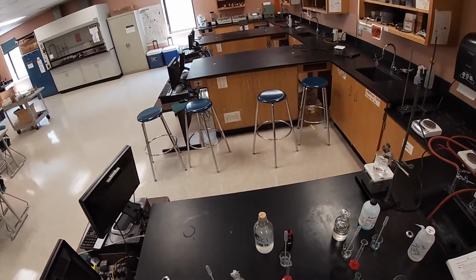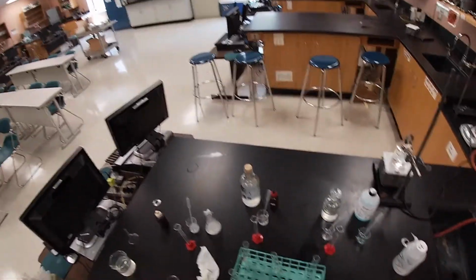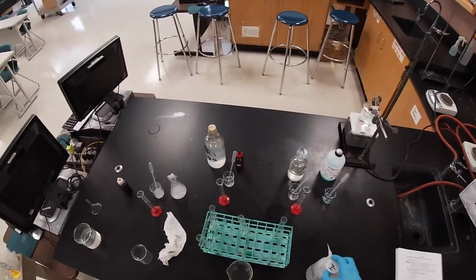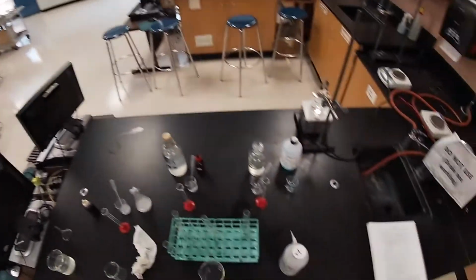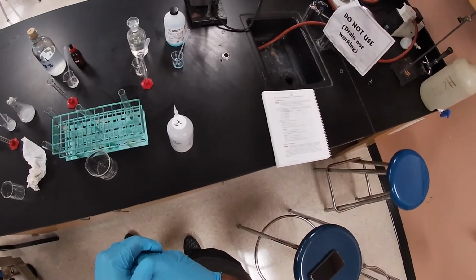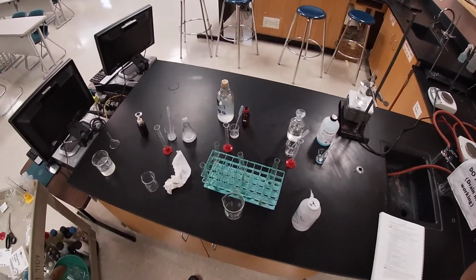And then I'm going to make a knot at the top, and then we're going to place it into this 250 milliliter beaker. We're going to first rinse it out with some distilled water. And then we're going to completely submerge the dialysis tubing in water. Initially, we're going to take our calculations.